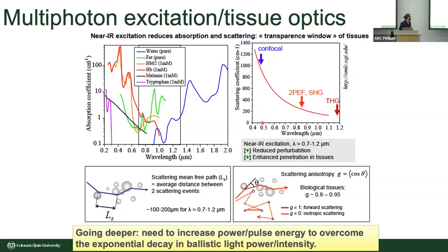If you're illuminating something like DAPI versus something like a red fluorescent protein, we'll be up and down the spectral range here. But imagine our canonical GFP molecule, that's right around 490 nanometers. That's where we'd want to illuminate. And you see how much we'd scatter versus when we illuminate with two photon excitation, the same molecule, how much lower that scattering coefficient is. So that's an indicator that we can deliver ballistic light deeper within the specimen. And that's going to allow us to form a tight focus that gives us a better image deep in tissue.